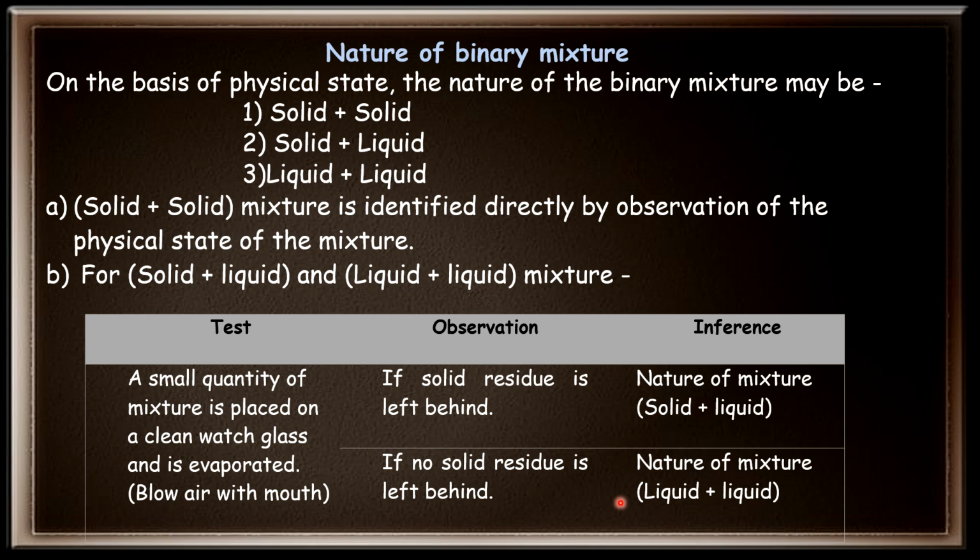In this video, we are going to study how solid plus liquid and liquid plus liquid mixtures are separated into their individual components, and how their type, that is, the type of the mixture, is determined. Let us study that.